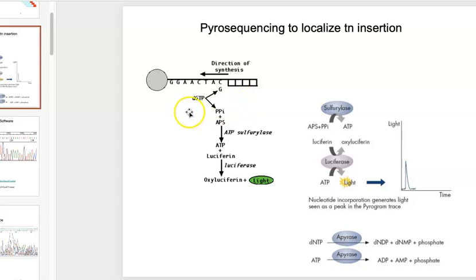So imagine a nucleotide. There are other nucleotides in the pool as well, like dATP, for example. What the machine will do is first feed a dATP over here, and that won't get incorporated, so it gets dissolved and broken down. The machine will feed a dTTP, and that will get dissolved and broken down because it's not incorporated. And then eventually it'll get to dGTP, or whatever nucleotide base is required, and that will be incorporated.